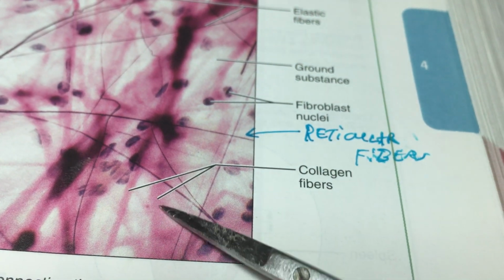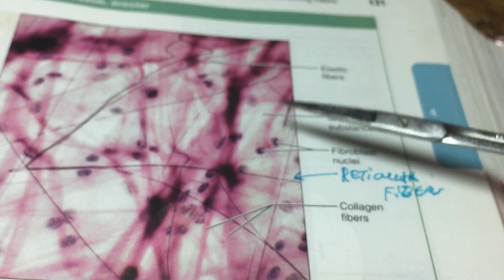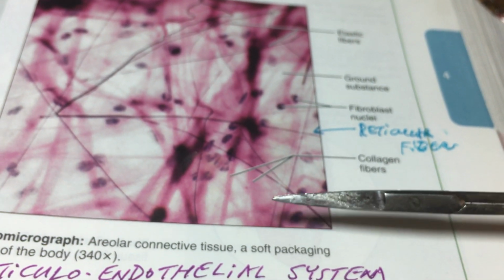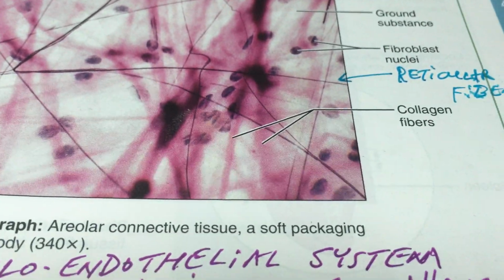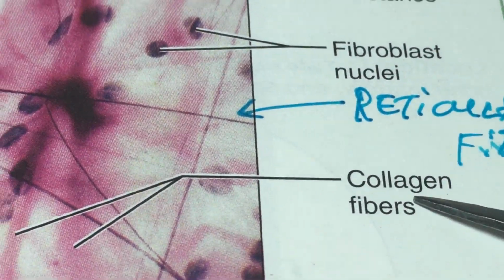Collagen is the pink. Do you see these big pink bundles going through here? Sometimes they're more wrapped together, sometimes they're a little bit more individualistic, but you get the idea of the pink bundle right there, and that's the collagen representation.